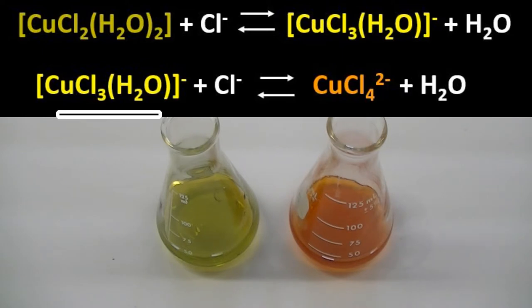Further, the yellow trichloro-species reacts with chloride ion to form an orange tetrachloro-copper-2 ion. Both these equilibria are driven to the right by the increased chloride ion concentration from the addition of salt.